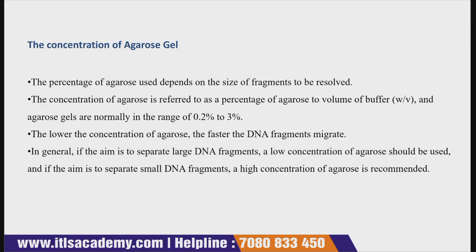In general, if the aim is to separate large DNA fragments, a low concentration of agarose should be used. It is always recommended to use a low concentration of agarose for large DNA fragments. And if the aim is to separate small DNA fragments, then a high concentration of agarose is recommended. Why?